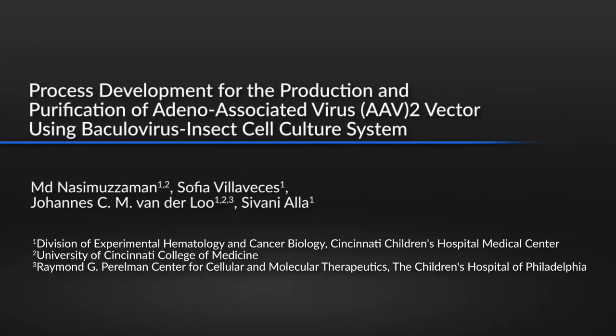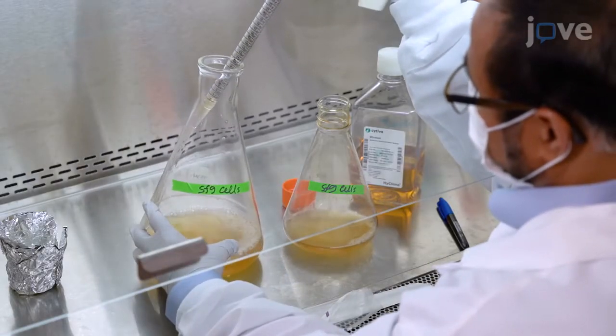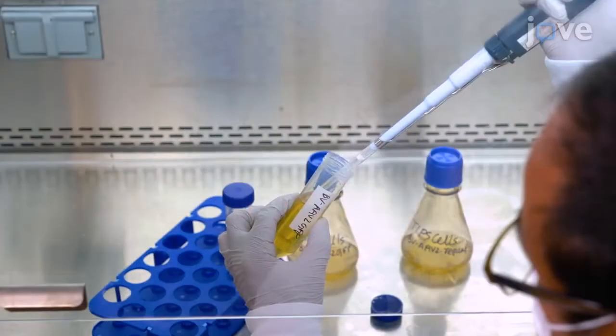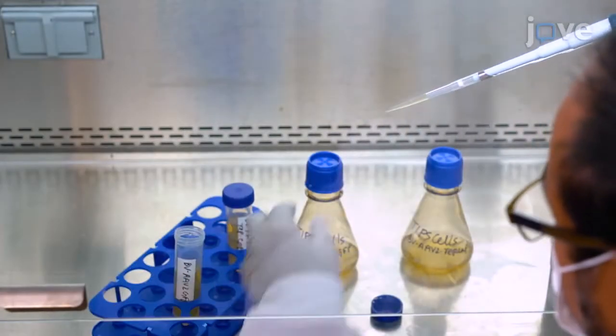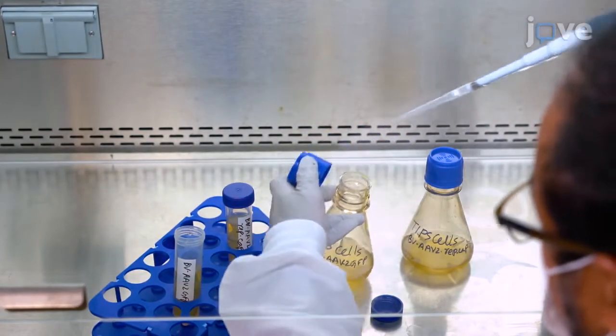This protocol will be useful for investigators who want to develop methods for AAV production and purification using the baculovirus insect cell culture system. AAV production using baculovirus insect cell culture system is a cost-effective method that is easy to scale up and is compatible with current good manufacturing practice.